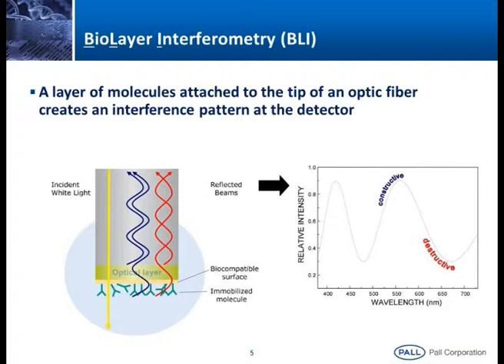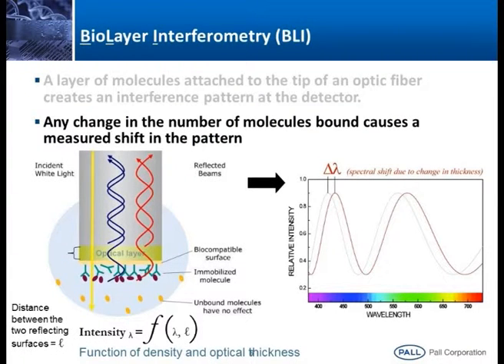Constructive interference makes the signal rise; destructive interference makes the signal drop. Suppose I dip the same sensor into the corresponding binding partner. I am giving an example. Here I am coating a sensor with a Protein A matrix. Protein A has a strong interaction with a monoclonal antibody.